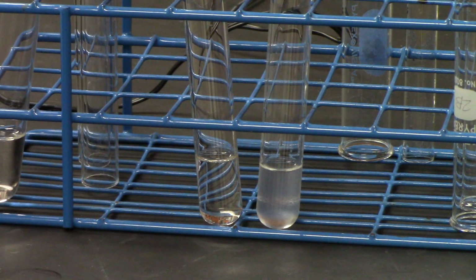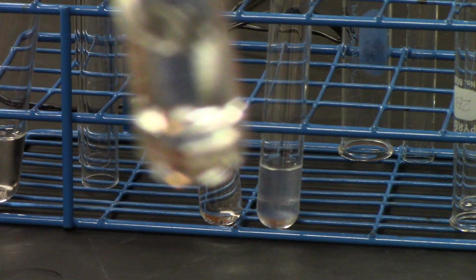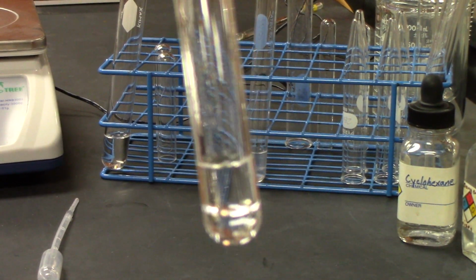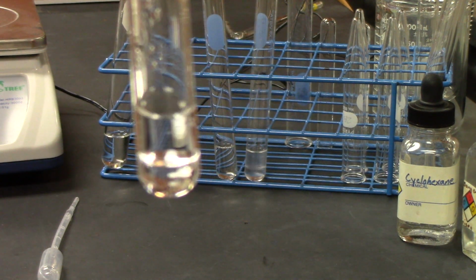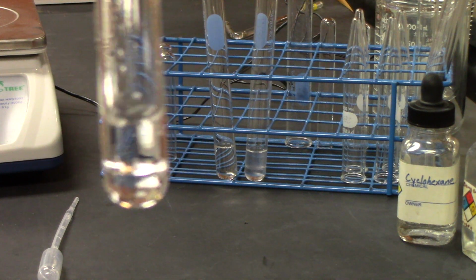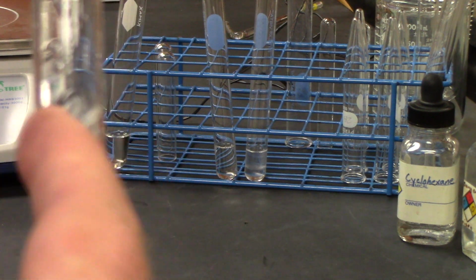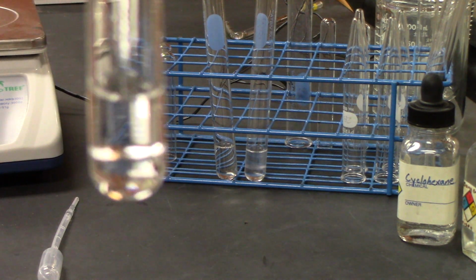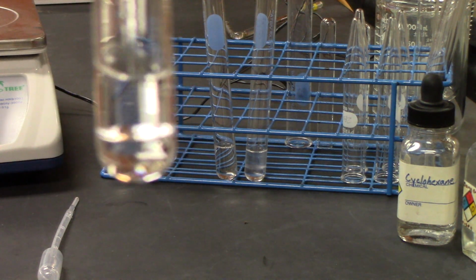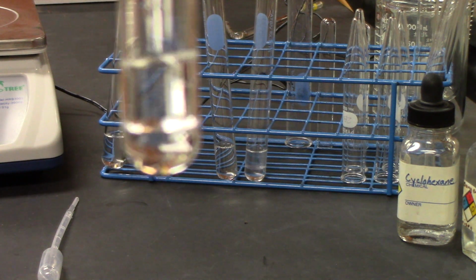So this one is the water and the unknown. And I hope you can see that there is a definite separation, okay? There at the bottom there's something, and here at the top there's something. And I don't know which one it is, but I know that water and my unknown are insoluble. So write that down, that water and my unknown are insoluble.